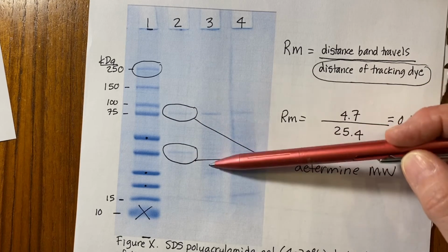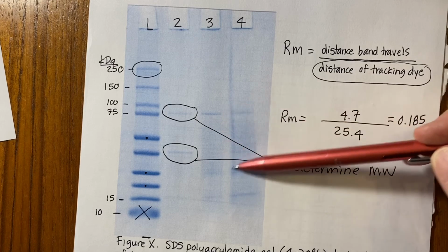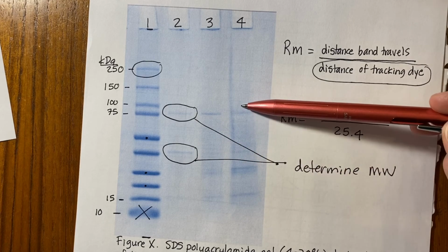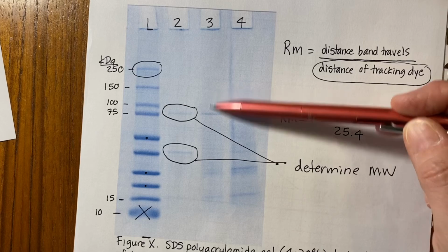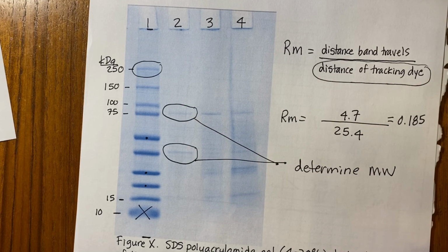The dialyzed protein should be similar to the crude because we really haven't taken very many proteins away between these two steps. But from the dialyzed protein to the gel filtration column, we were hoping to purify some of the protein away. And based on that Bradford data from the gel column, we should have purified some protein away.